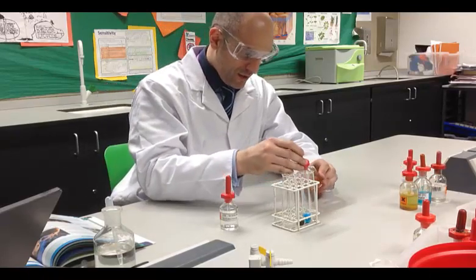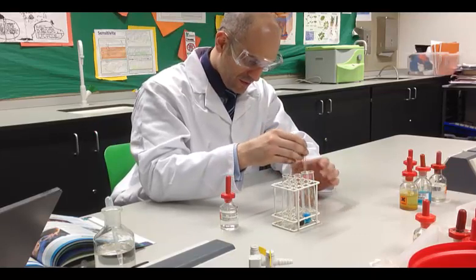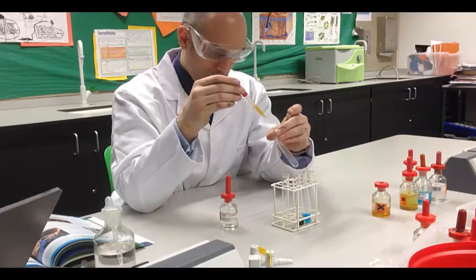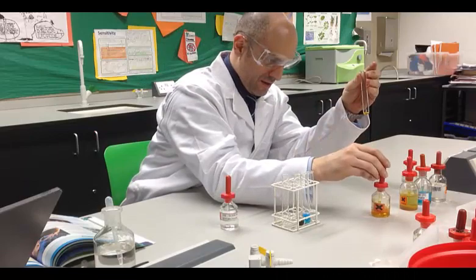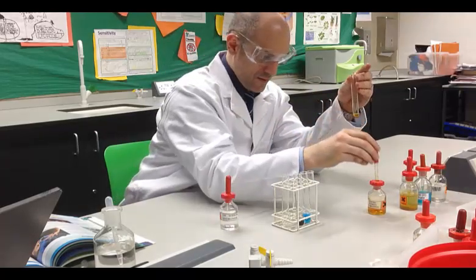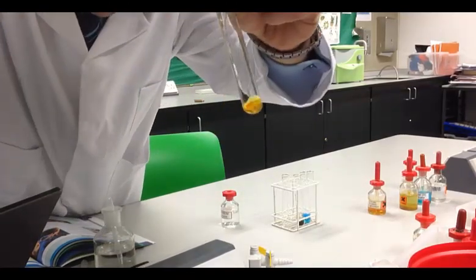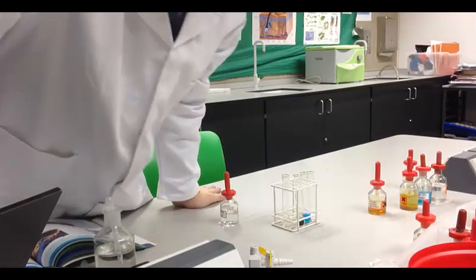Finally, we've got iron 3. Okay, pipette's not working very well. There we go. Oh, I haven't done calcium. Okay, here's iron 3. Right, let's add some hydroxide. If you watch, let me do this a bit closer to the camera this time. And see, you get a red-brown gelatinous precipitate.